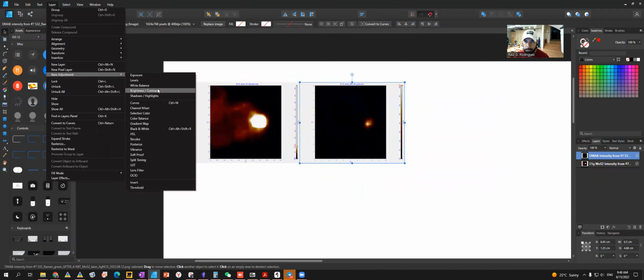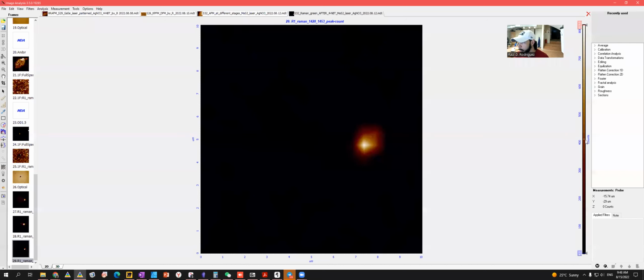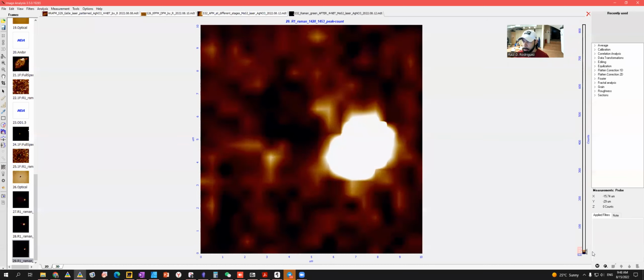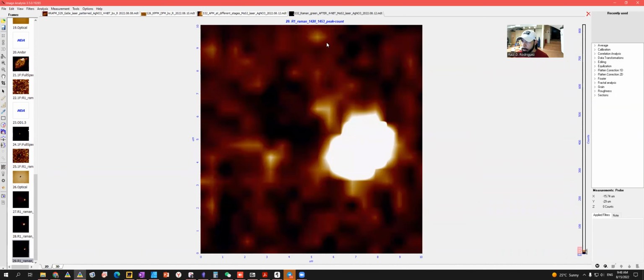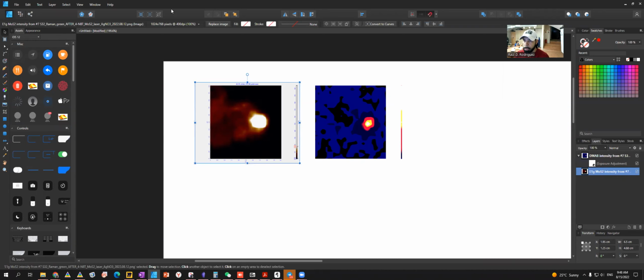So, for example, if I go on with exposure to see the rest, kind of. So let's see. This is how it looks like. Let's see if in reality it's like that. You see how it looks like. Black. Yeah. Okay, maybe yes. Maybe it could work. Yeah, that could work. Then let's try the same here.